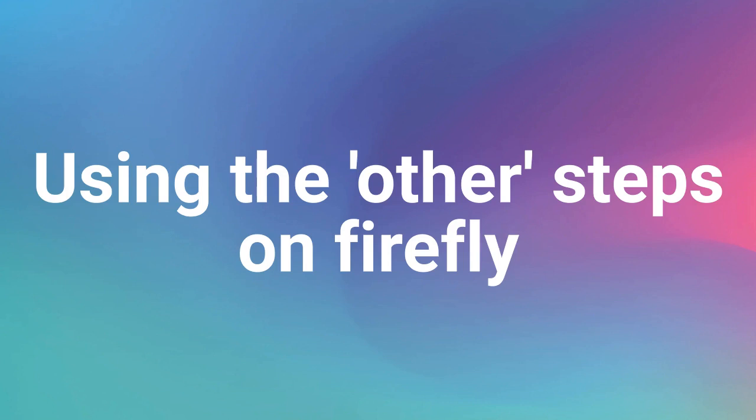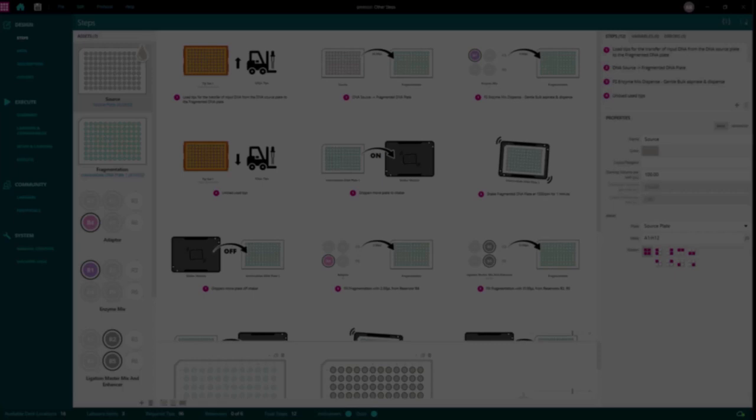Hi guys, today we're going to look at the Other Steps section of the Firefly. The Other Steps section has a selection of useful steps that allow protocol writers to input pauses and user information into the protocol. There are three main steps in this section.